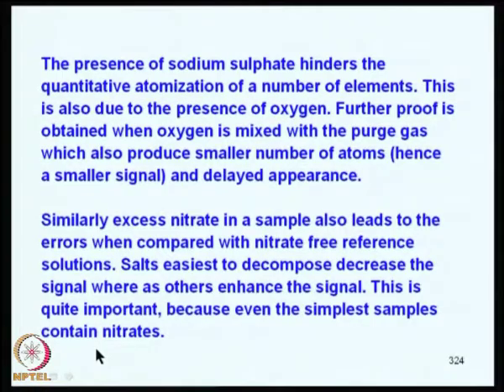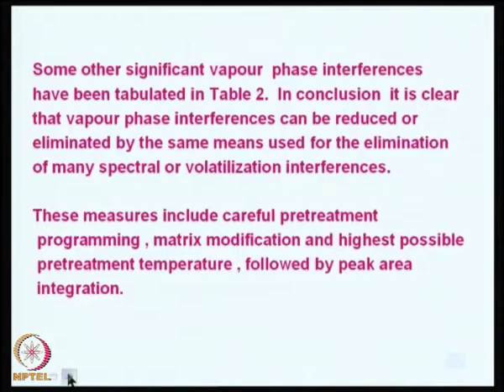systems always work whenever you operate with matrix modifiers. So, you can take care of most of these things, and the salts easiest to decompose, they decrease the signal. So, you should always add salts which do not decompose easily, whereas others, this is quite important because even the simplest salt samples do contain nitrates.